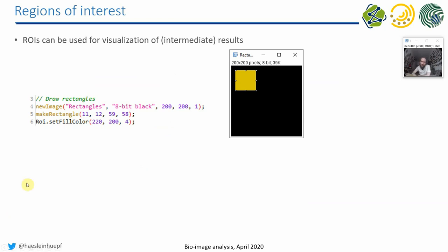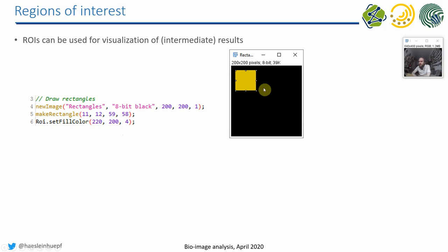So let's assume we just selected an ROI in the ROI manager. And we now want to make it a yellow rectangle. So we can call the ROI setFillColor method in order to make it look like this. And the three numbers here behind is the red, the green, and the blue channel. Red and green are yellow together, right?